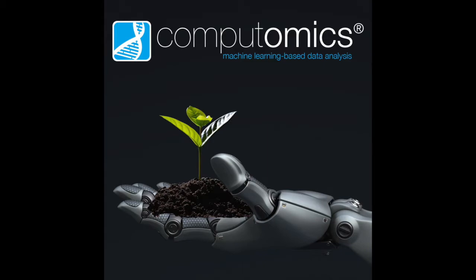Yeah, sure. So at the heart of MORPHEUS, we have the Megan and Diamond-based analysis pipeline that's very popular. So we are using Diamond to calculate alignments against the NCBI-NR protein reference database. And then we're using the lowest common ancestor methodology implemented in Megan to do taxonomic assignments. We're using the KEGG database for functional assignment. And so that's the basis or the fundamental analysis. And then we have a series of R data analysis scripts that basically create tables, do summary plots and visualizations.